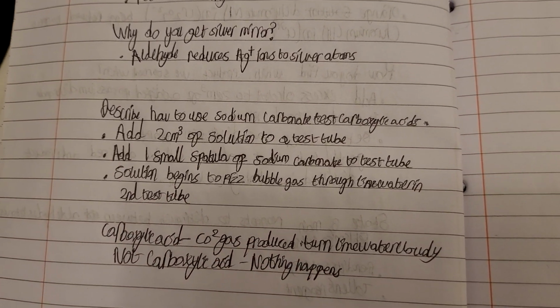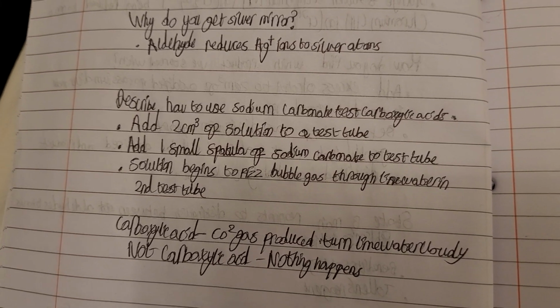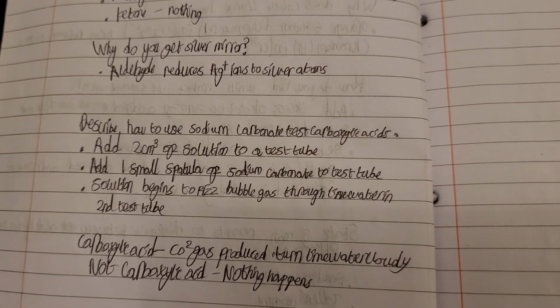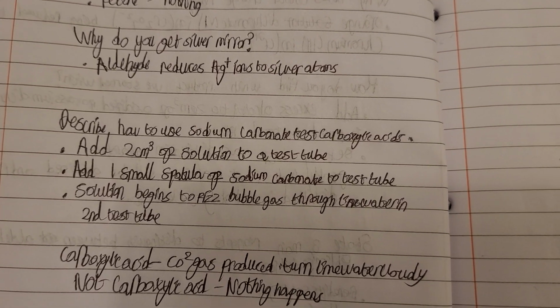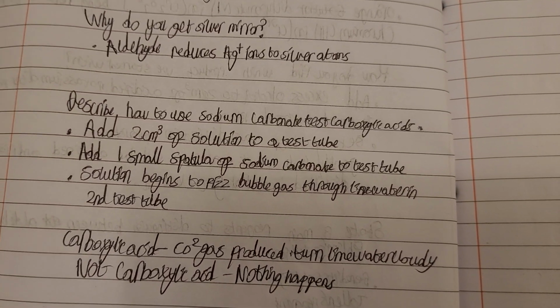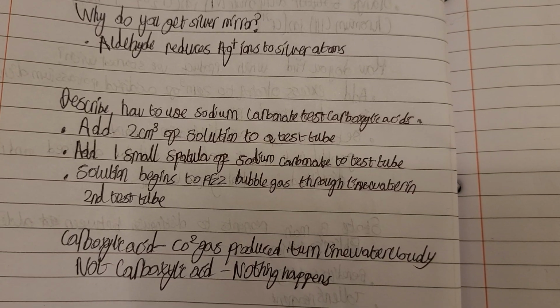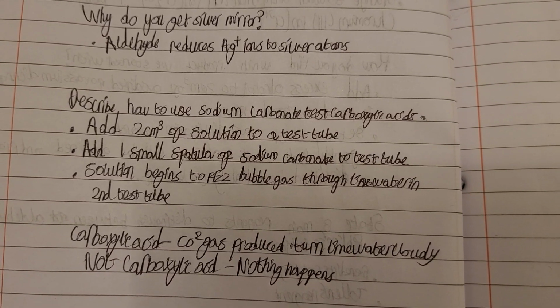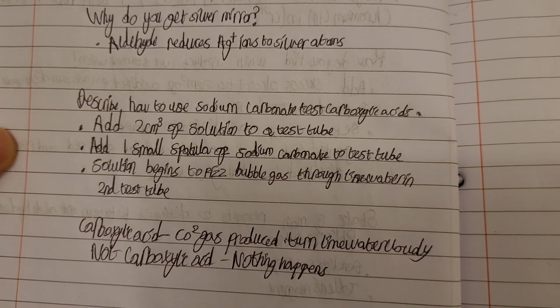One more key thing about the sodium carbonate test for carboxylic acids is that it will always give a positive result with any acid. So when you're distinguishing between organic compounds, you have to make sure that one of the organic compounds is actually a carboxylic acid. You have to be sure of that.